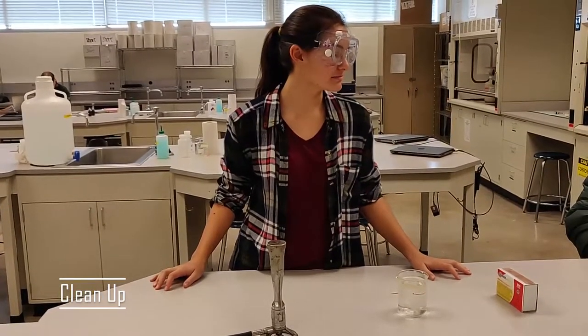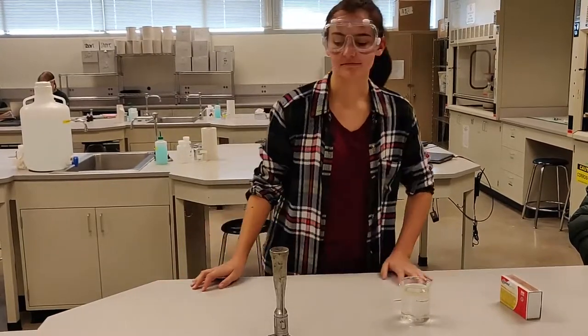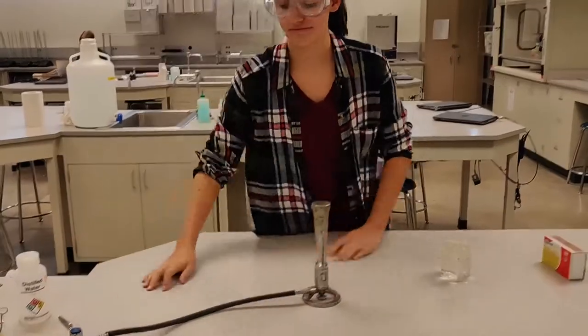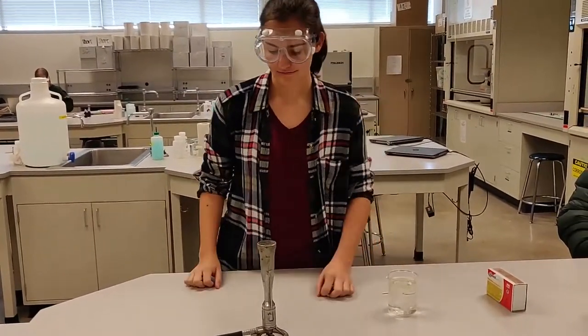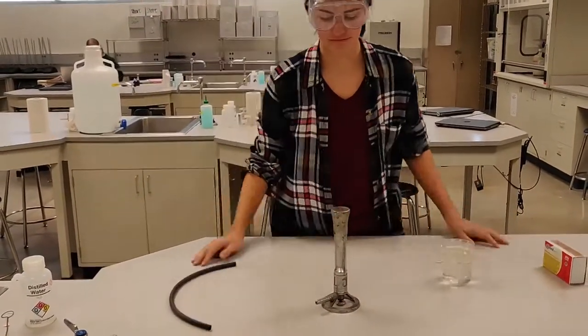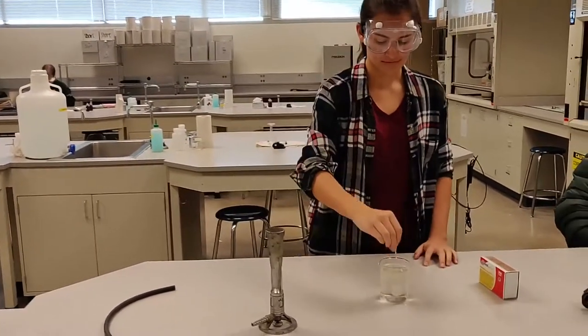If you are done using the Bunsen burner, please make sure that the flame has been extinguished. Double check the gas tab is turned to the off position. The tool can be disassembled by removing the tube from the burner and the gas tap, and return those materials to their original location. Make sure matches are disposed of properly and completely extinguished before disposal.